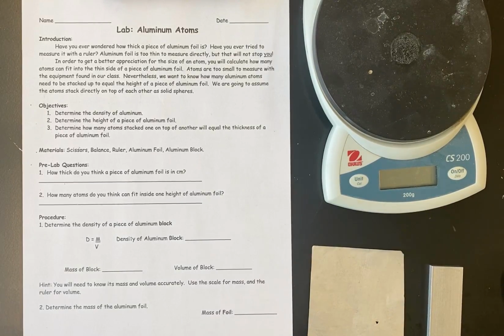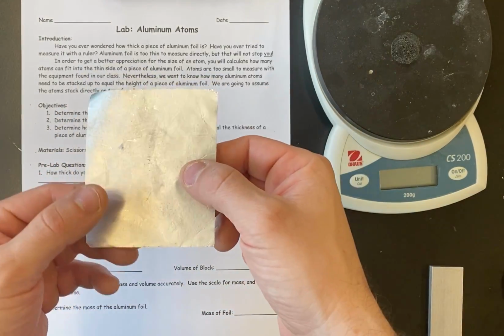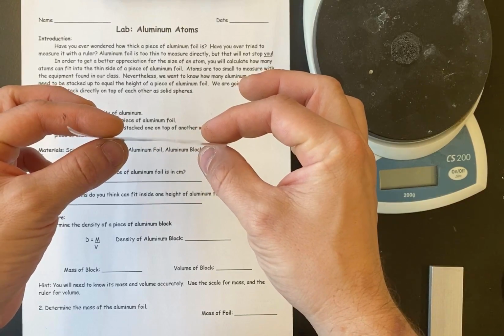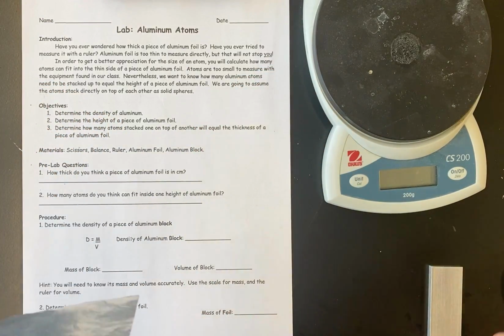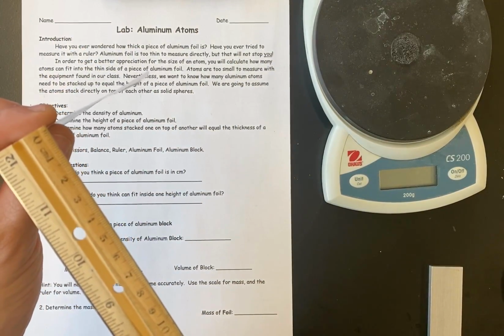In this video, we are going to determine the height or the thickness of a piece of aluminum foil. So not this way, not this way, that way. We're going to determine that using some less than obvious approaches. The most obvious approach would be to try to measure it, but it's too thin, so you're not going to be able to get a good measurement.